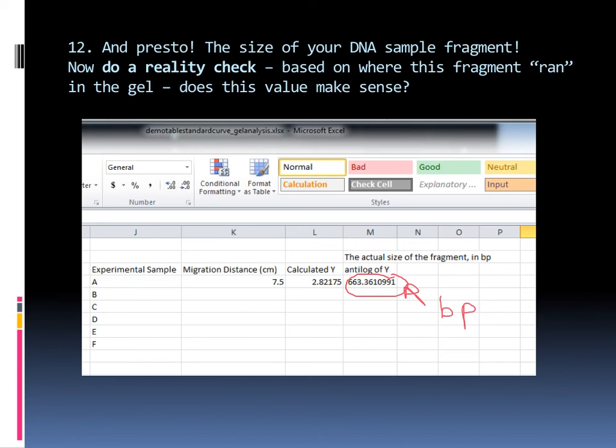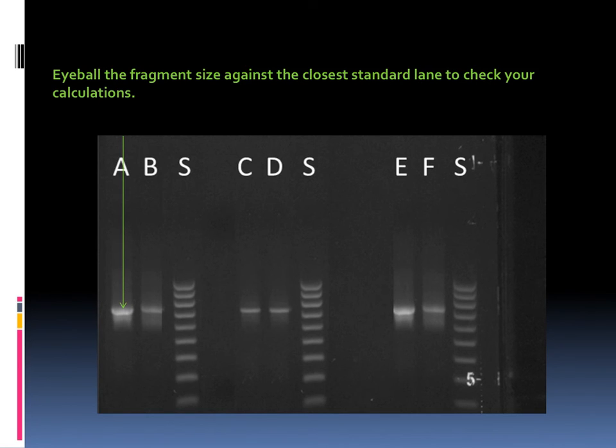So now we want to do a reality check. Like, does that make sense? Should I have gotten something that was around 663 base pairs? How do we double-check that? Well, we go back and we look at the gel. We look at the gel again and we ask, if we were to overlay A and S1, where would the A fragment fall? So by eye, I can look at the A fragment here, and I can see that it would probably fall somewhere in this range. Well, what range is that? If this is 900 up here, this is 800 base pairs, this is 700, and this is 600 base pairs, then that tells us that the A fragment would fall between 600 and 700, and therefore our calculated value of 663 base pairs for the A fragment is very reasonable. That validates or suggests that our standard curve and the use of it is quite good.